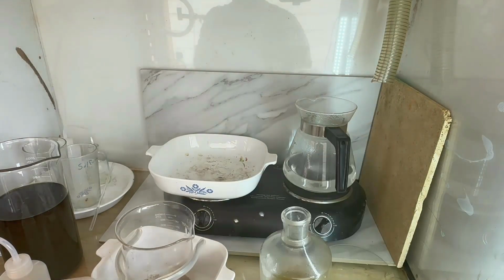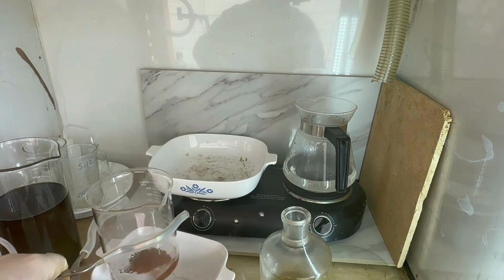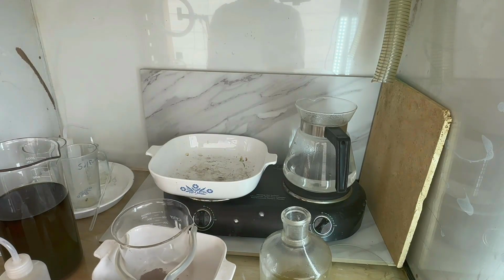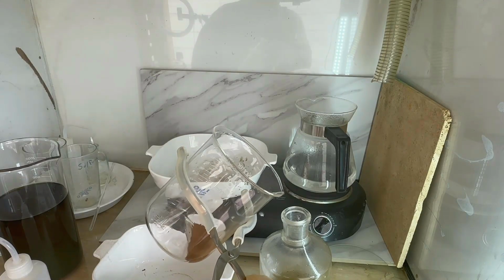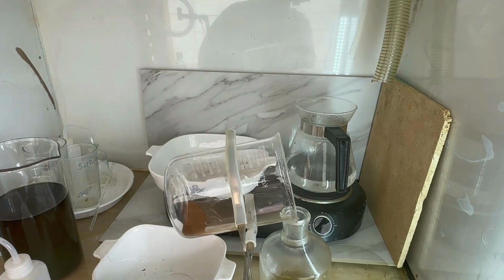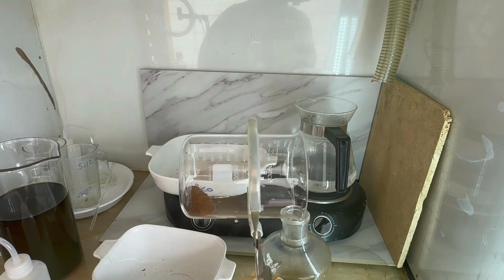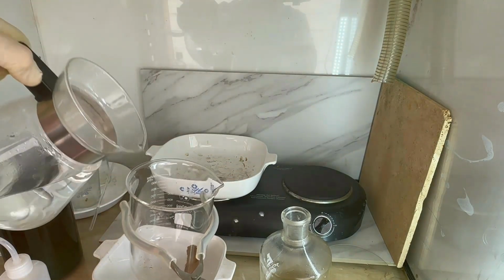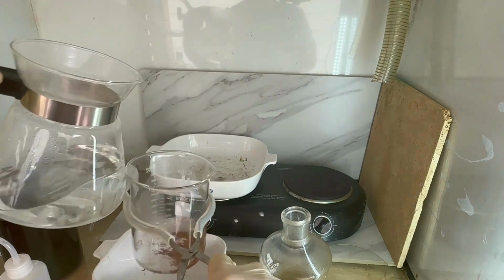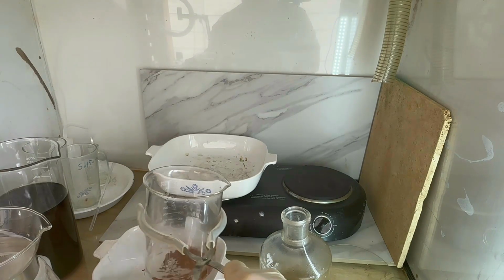So we can switch into hot water here. So I got some hot water in there, going to swirl it around. Going to do several of these hot water rinses. The one thing you can see there, I'll show it here, is that it settles very quickly. The gold is no longer that really fine powder that likes to stay suspended in solution. Makes this a really easy process to go through. We're just going to do this over and over, get as much of the acid out, and as much of any other contaminants that come with it, out.